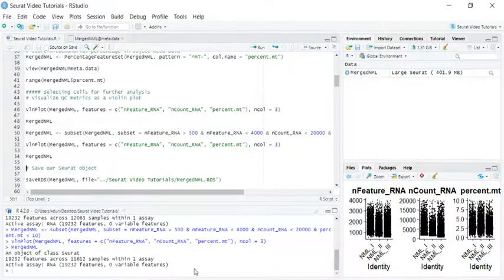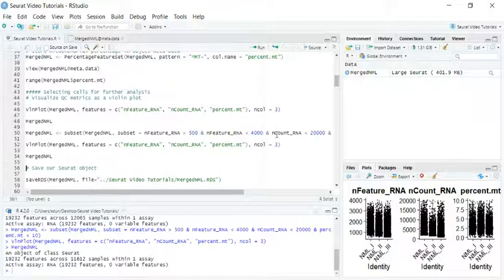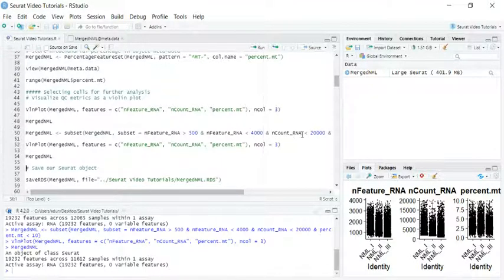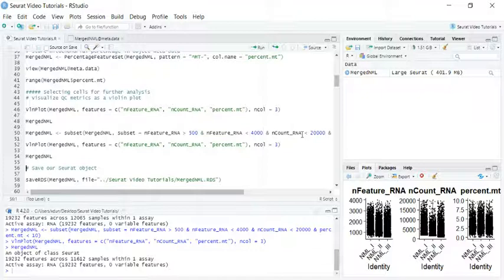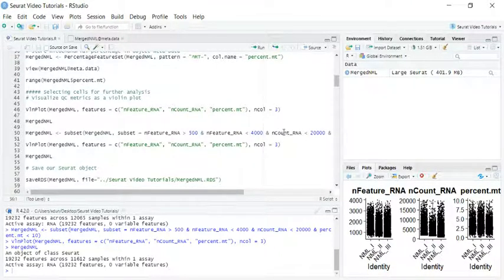You probably have questions about why and how we choose those parameters. I would say there are no absolute values to set for these parameters — it depends on the quality of your data and the cell population you are interested in. For example, if you are trying to find very rare cells in your tissue, you should keep the highest number to start with the analysis.